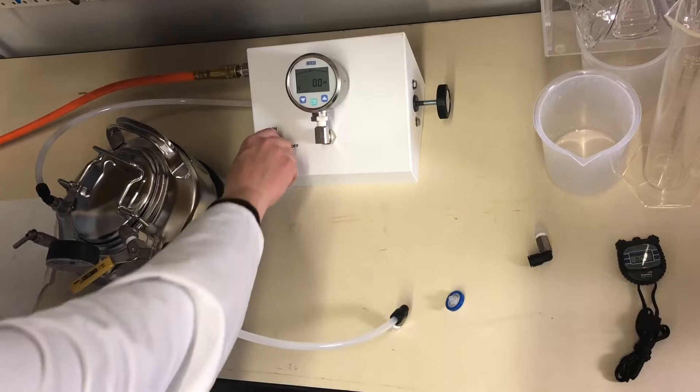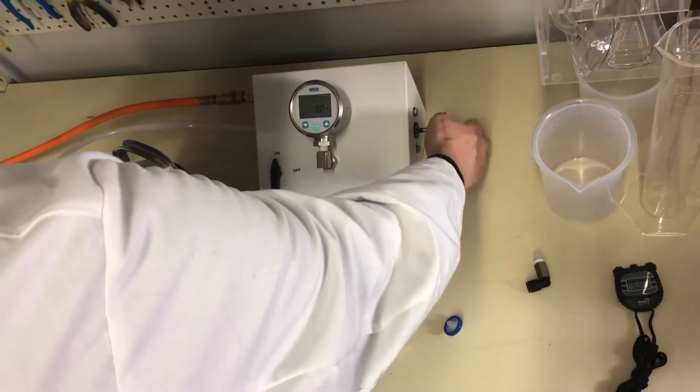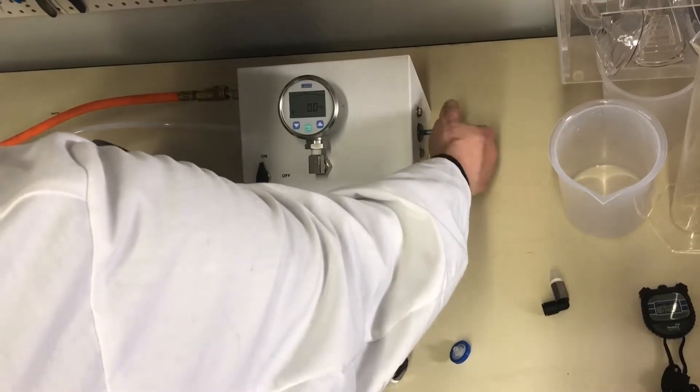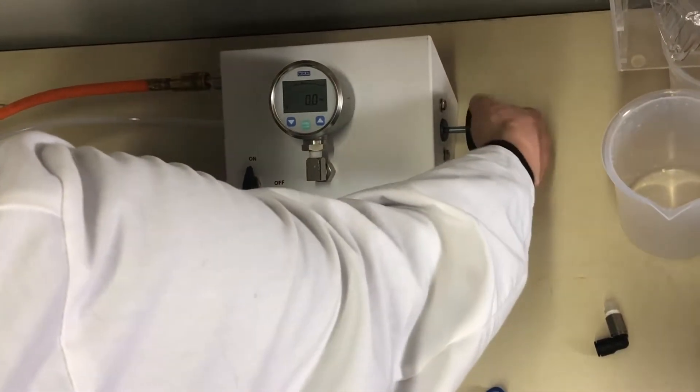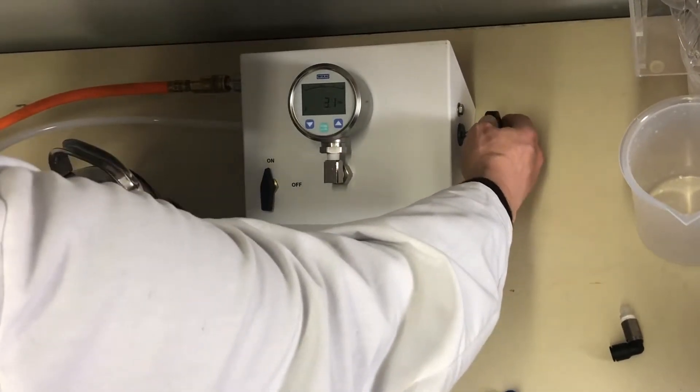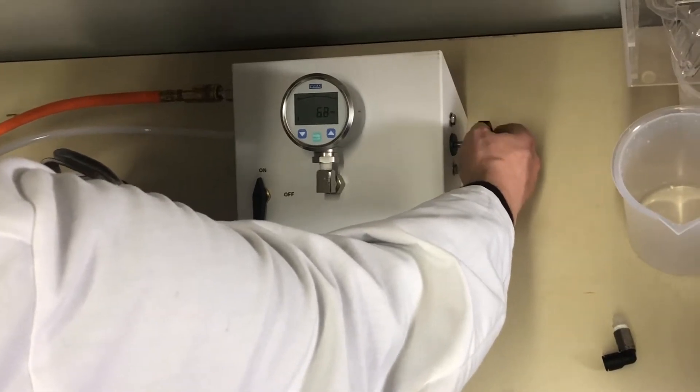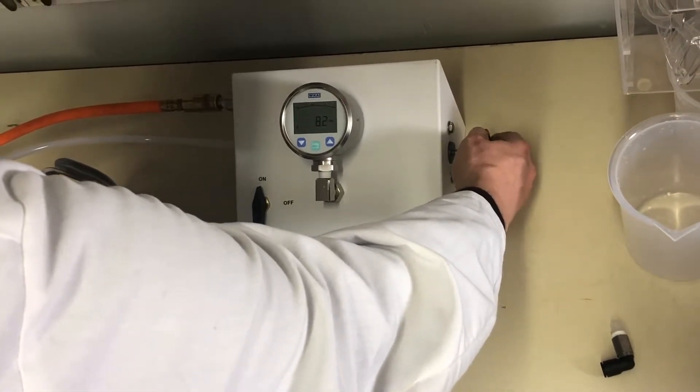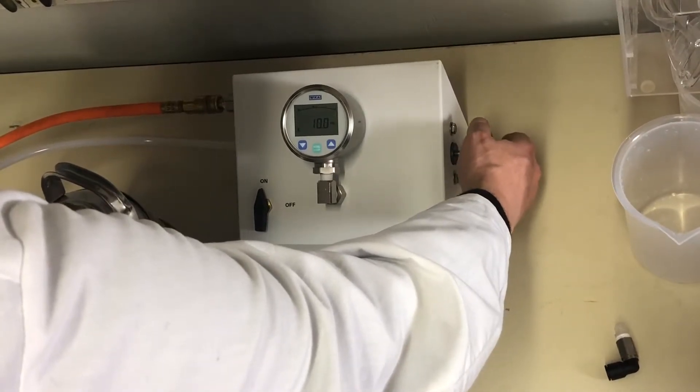Turn the gauge, turn the bubble point tester on, and then adjust the pressure carefully to 10 psi. So now we're pressurizing the pressure vessel.